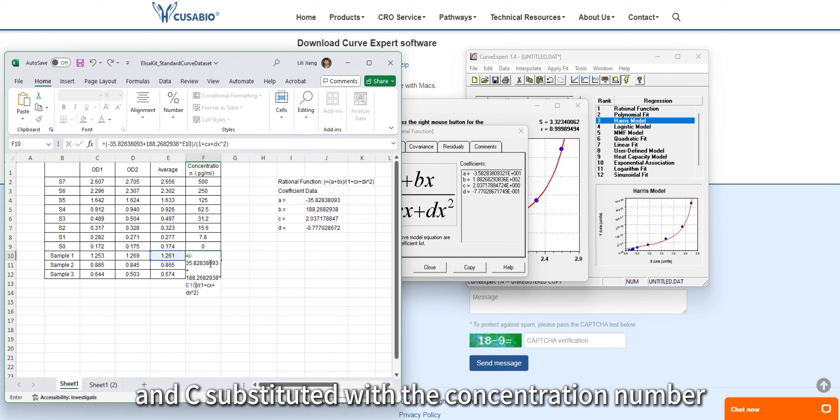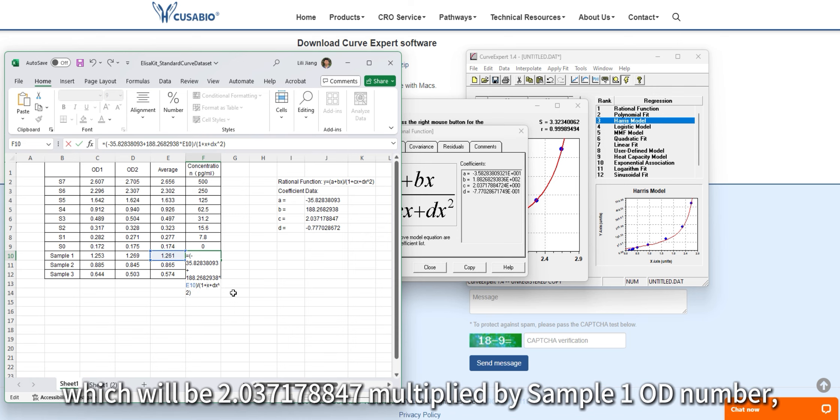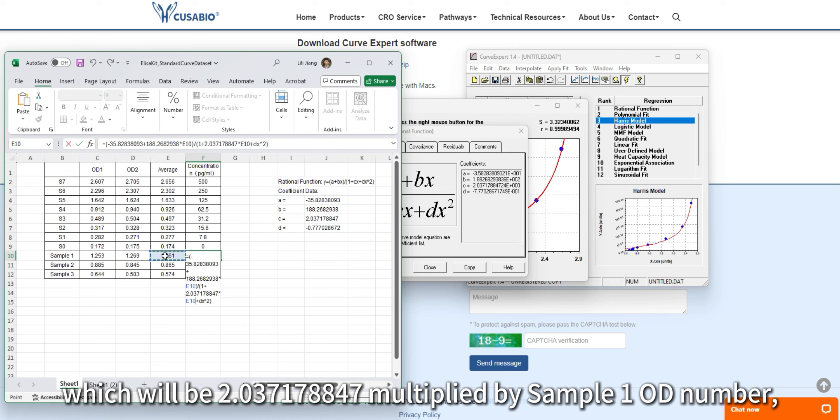C is substituted with its coefficient number, 2.031178847, multiplied by the sample 1 OD number.